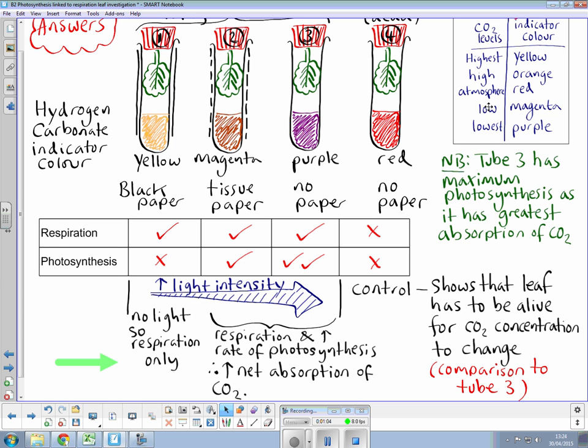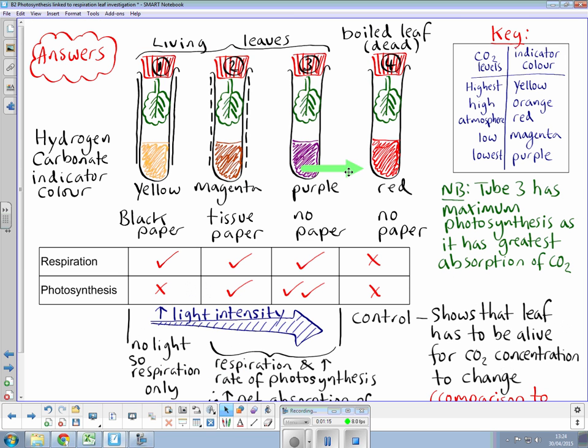We have a low level of CO2 in the atmosphere of the boiling tube going to lowest, so CO2 is being absorbed. As you probably guessed, the fourth tube here is actually a control tube.